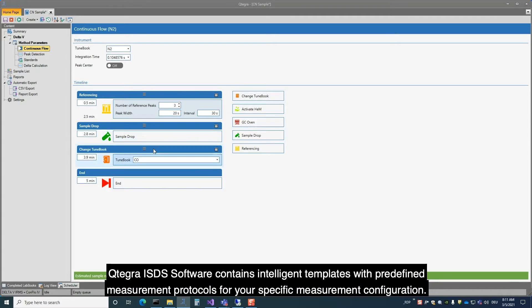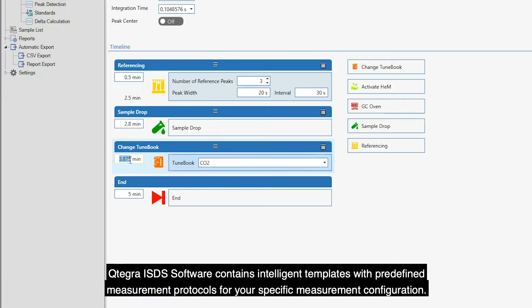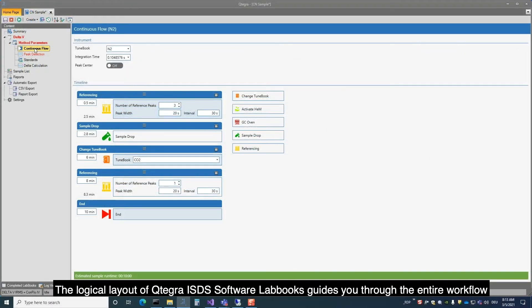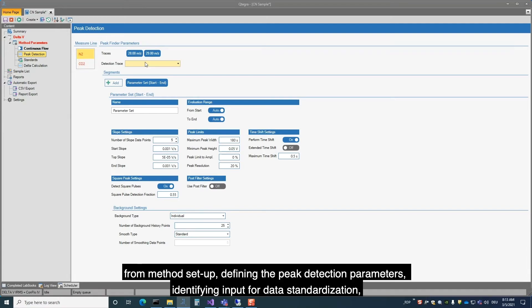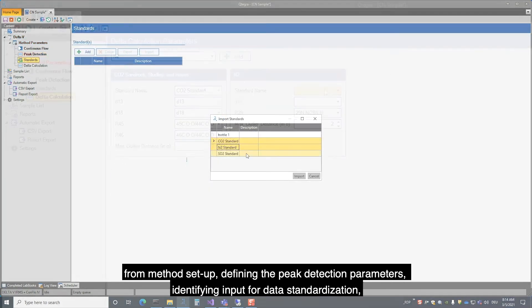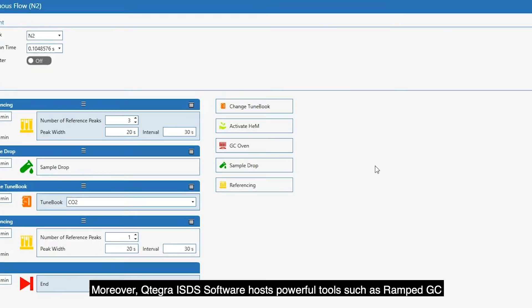Qtegra ISDS Software contains intelligent templates with predefined measurement protocols for your specific measurement configuration. The logical layout of Qtegra ISDS Software labbooks guides you through the entire workflow, from method setup, defining the peak detection parameters, identifying input for data standardization, through to setting up the isotope ratio calculation.